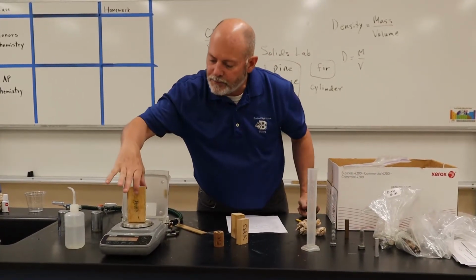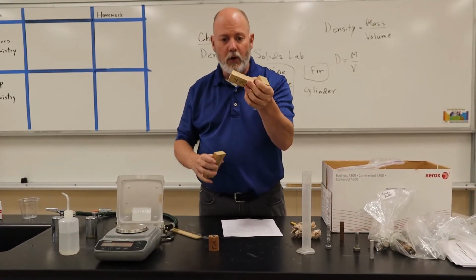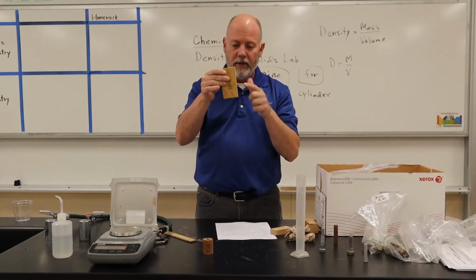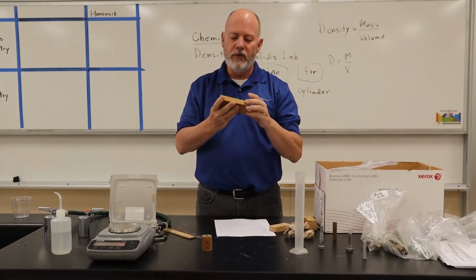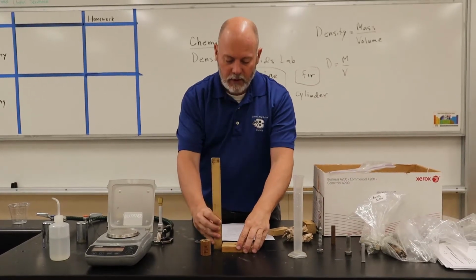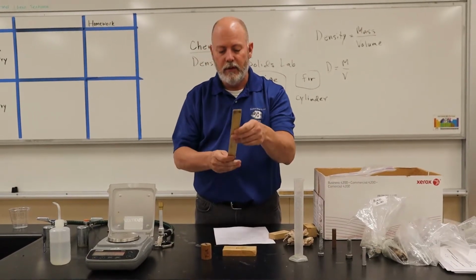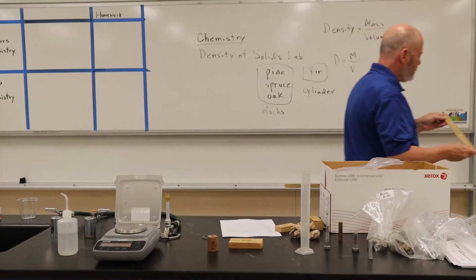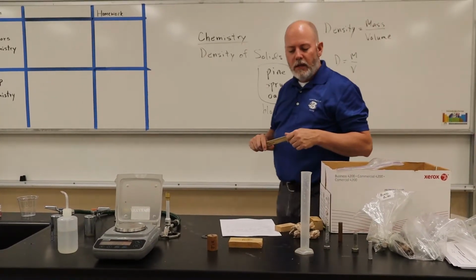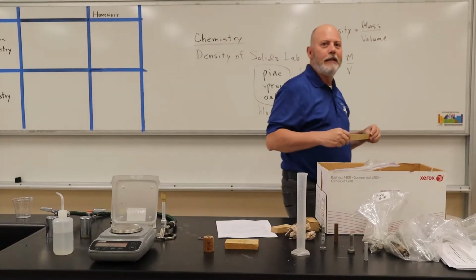All right, so now for the pine, the spruce, and the oak, we're going to do the 3 dimensions, right? Length, width, and height. Or as I tell the students sometimes, put it in front of you and just remember up, over, and out. Does it matter which side is height, which is width, and which is length? No, because you're going to multiply all 3 of them together. That's a question I always get.